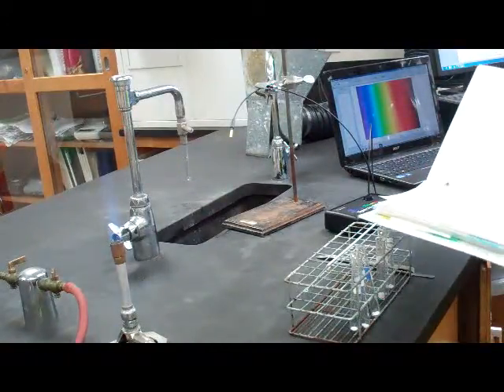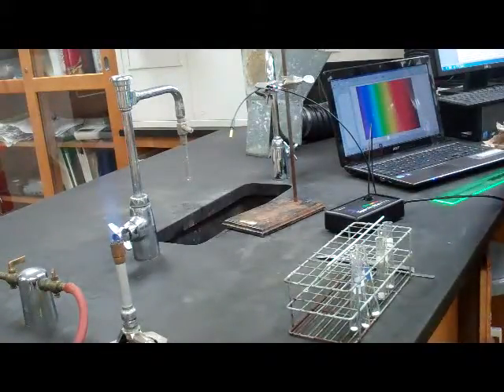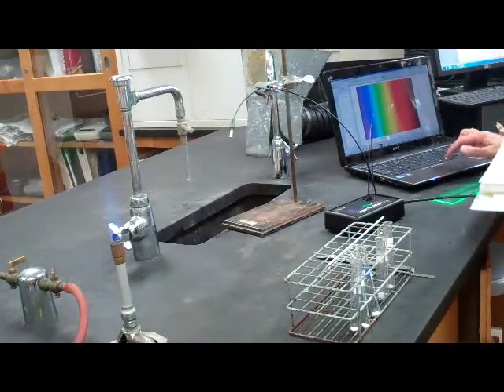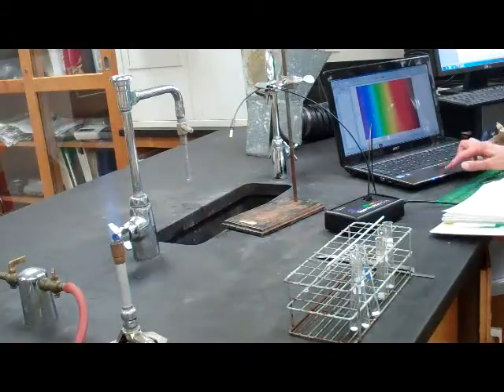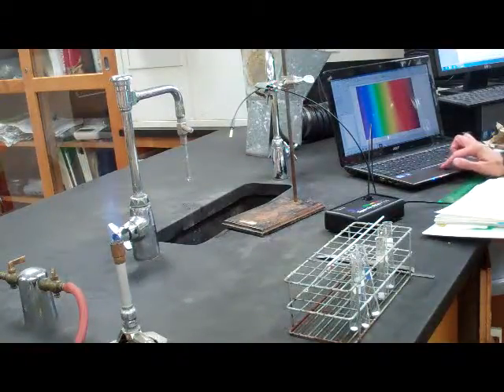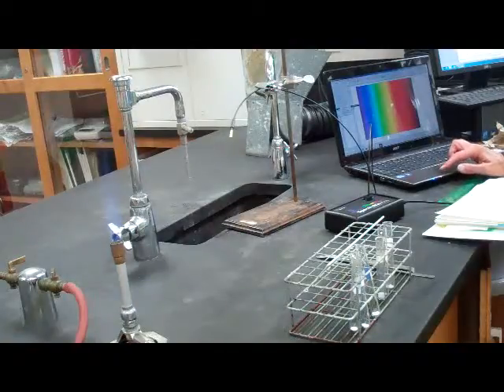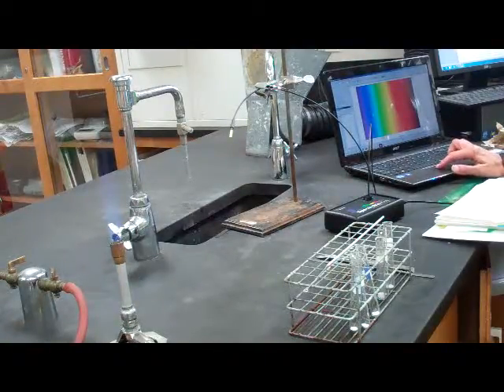Okay, so what our directions say here is on the computer we go to Experiment on the top menu bar, Change Units on the spectrometer 1, and we want to change the units to intensity.